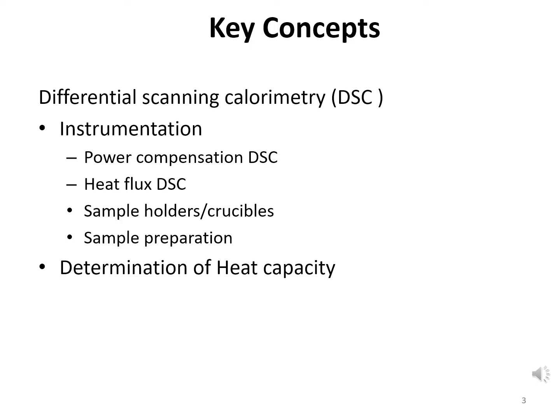The main concepts that we will discuss are differential scanning calorimetry and its instrumentation, as there are two types of instruments that could be used in DSC. One is a power compensation DSC and the other is heat flux DSC.